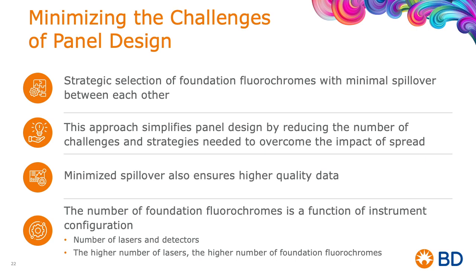So what I'm going to talk about in the last section of the webinar is a strategic selection of foundation fluorochromes with minimal spillover between each other. This approach simplifies panel design because it reduces the number of challenges and the strategies needed to overcome the impact of spread. Minimizing spillover and spread also ensures higher quality data because we are removing background.